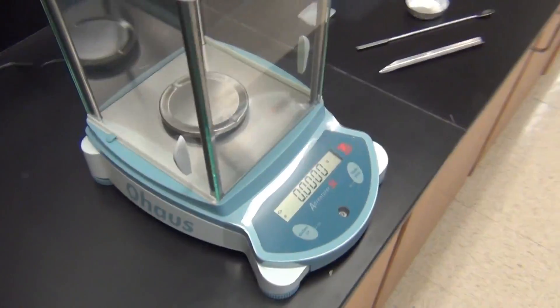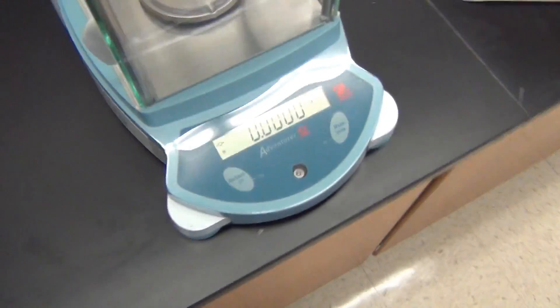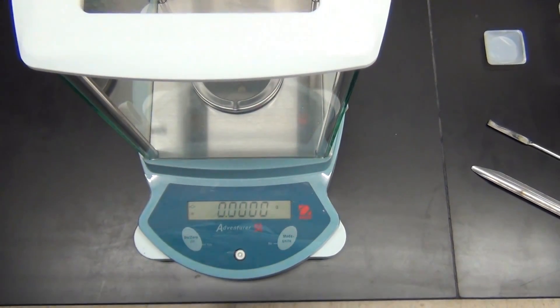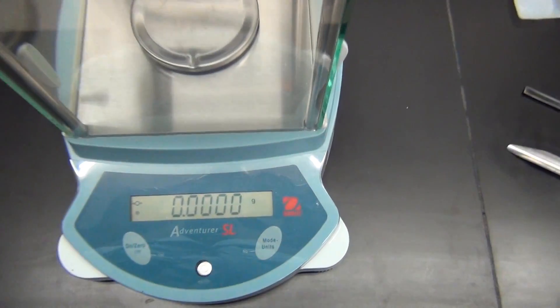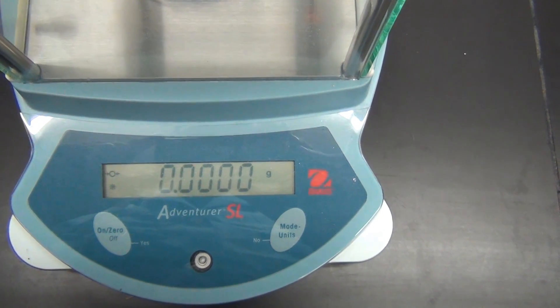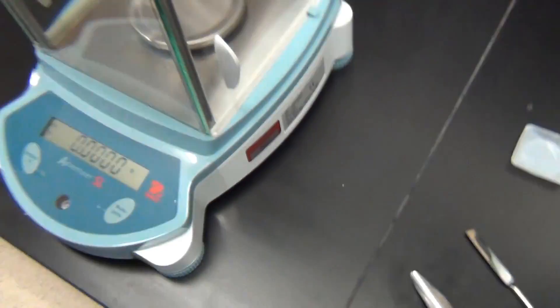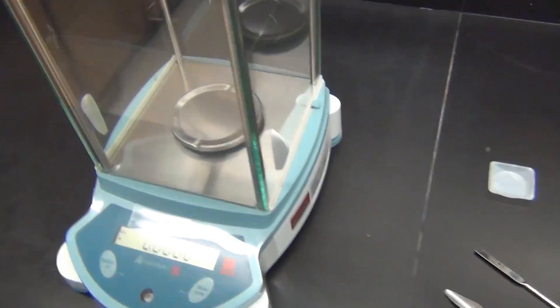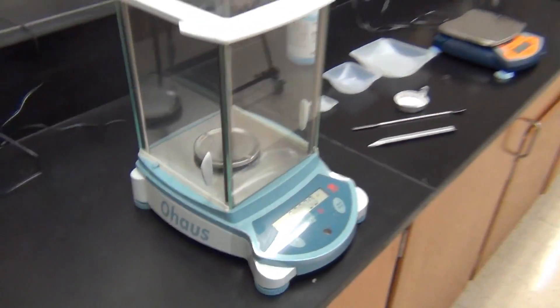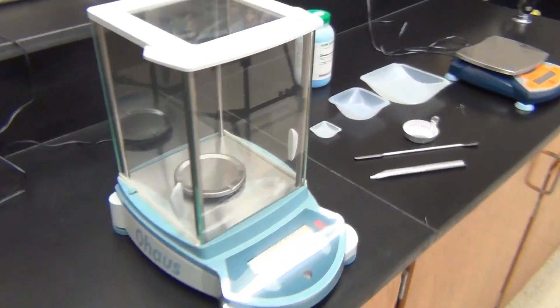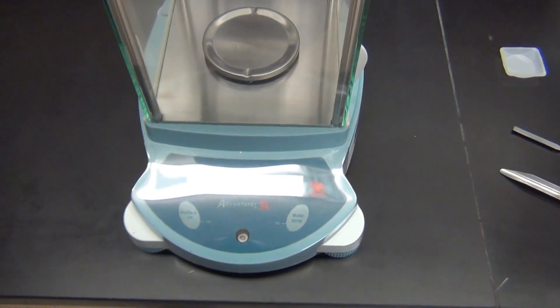The other balance we are going to talk about today is what's called the analytical balance. It will measure weights to the nearest ten thousandth of a gram. It is very accurate, it is very sensitive, and it is very expensive. Its price tag is $2,000.